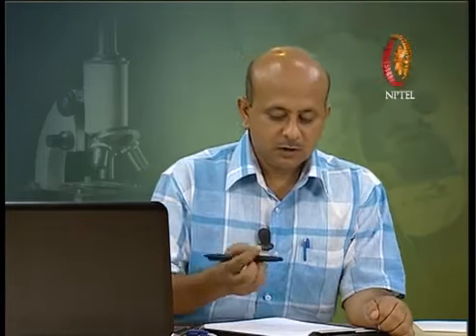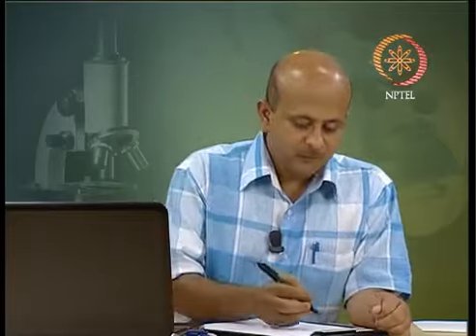Now, let me first tell you why the sample volume is very important here as compared to other chromatographic techniques, where larger volumes could be utilized in the column. Let us understand this. Suppose you have a column here, and these are your beads in the column. This is just a schematic; it needs to be a longer column.